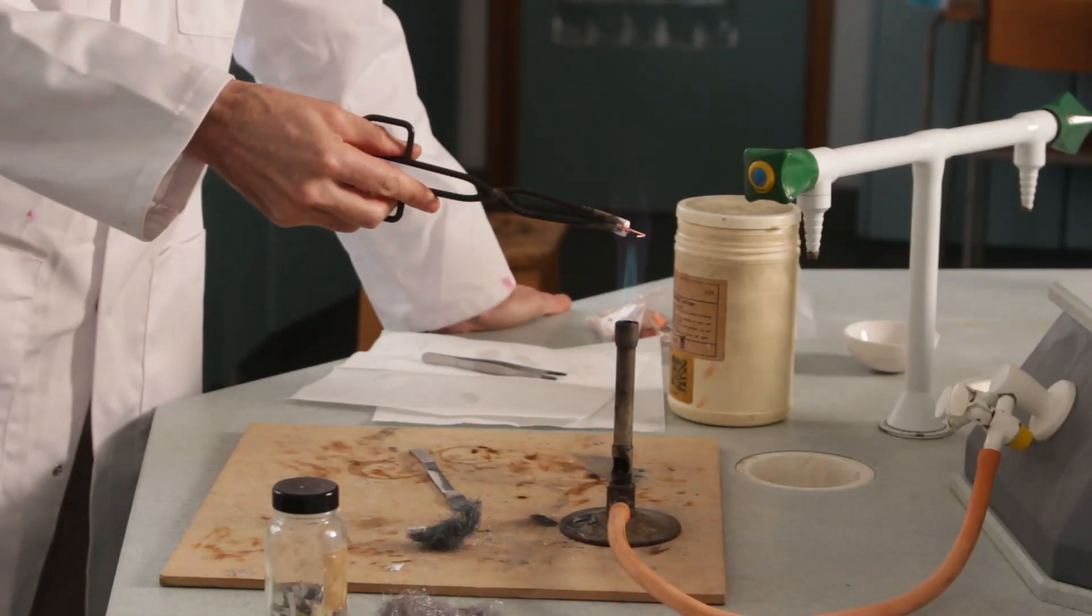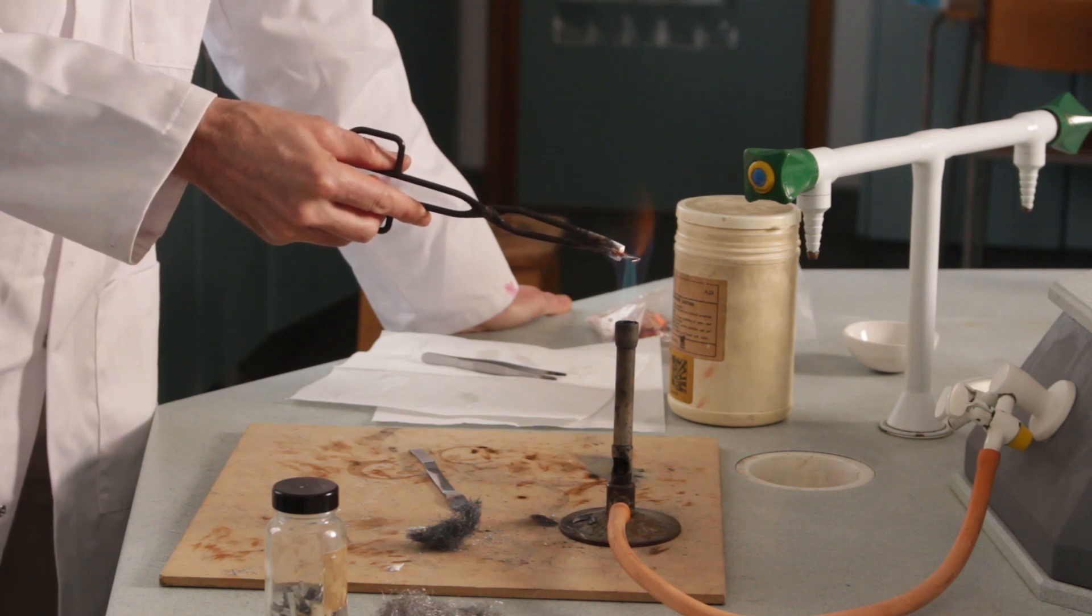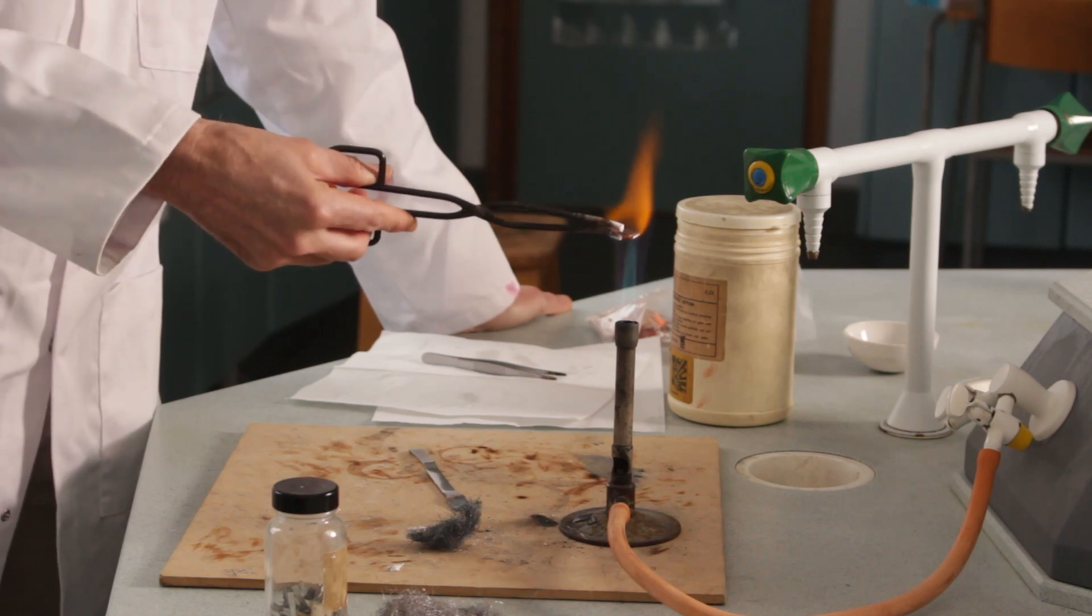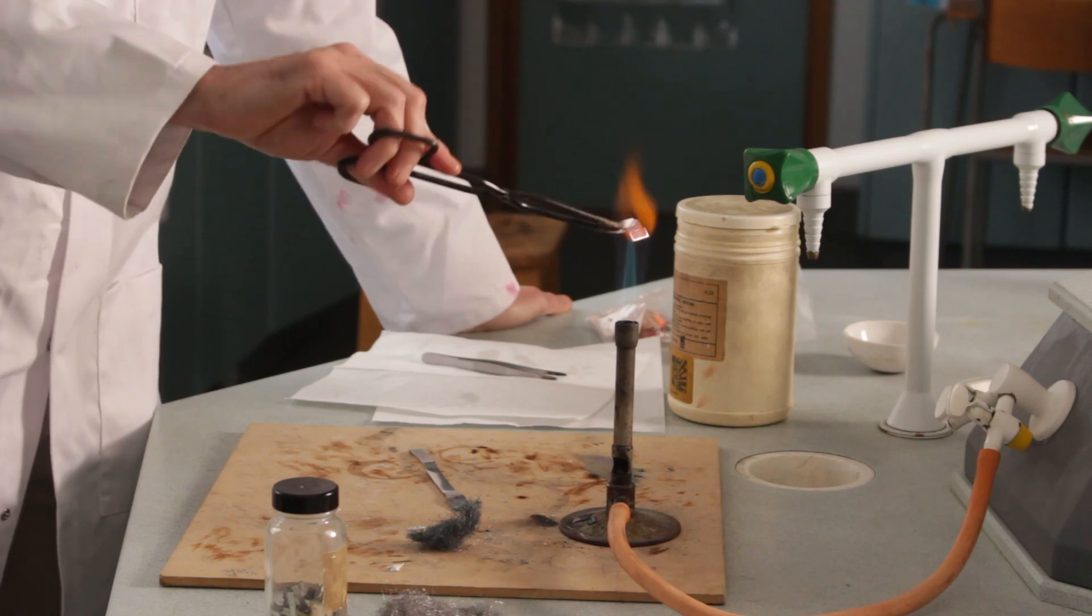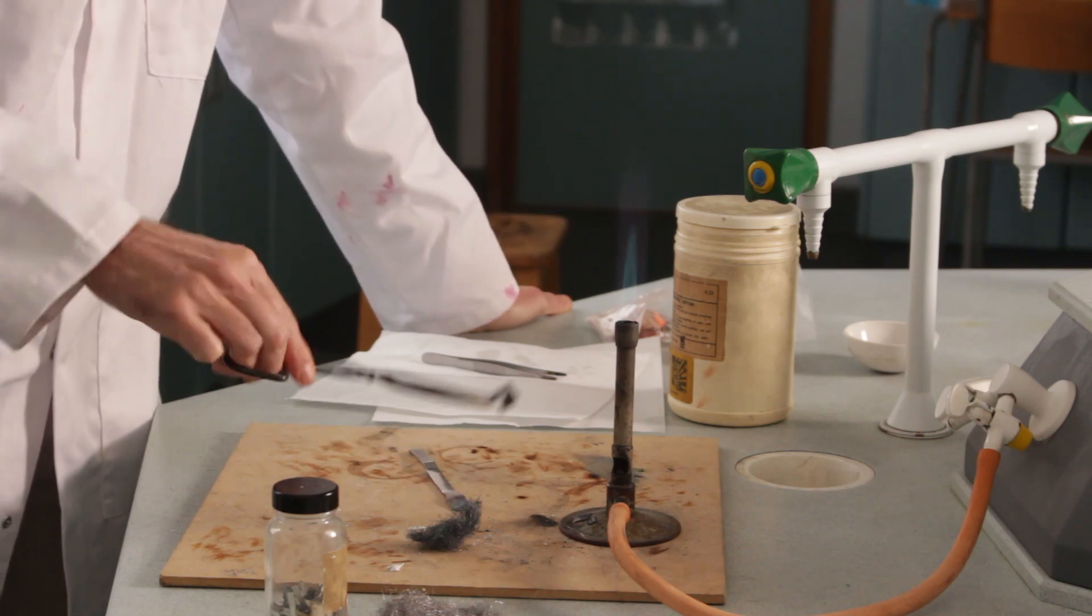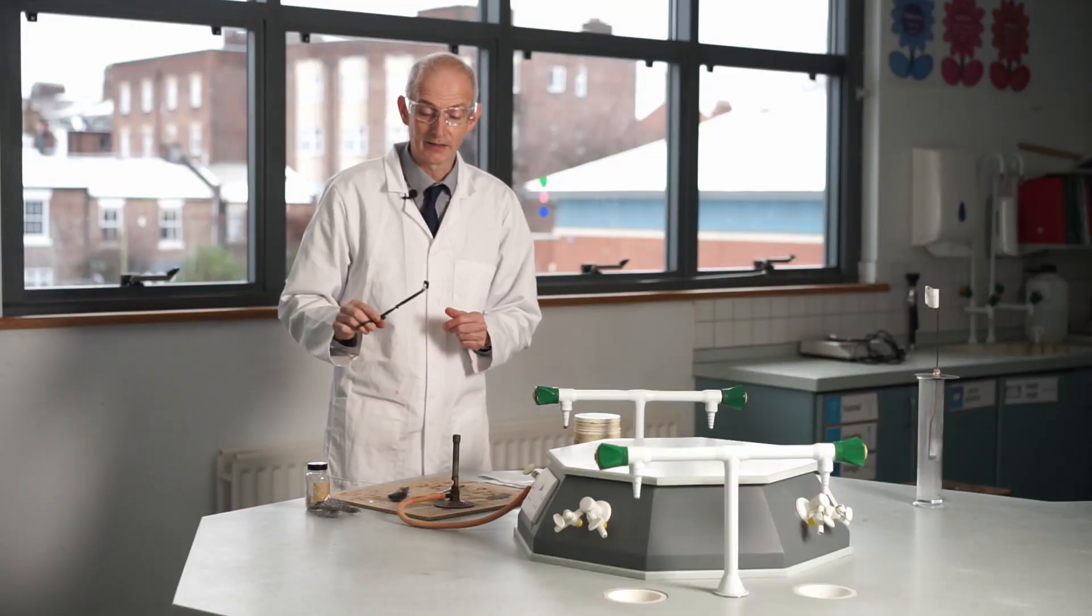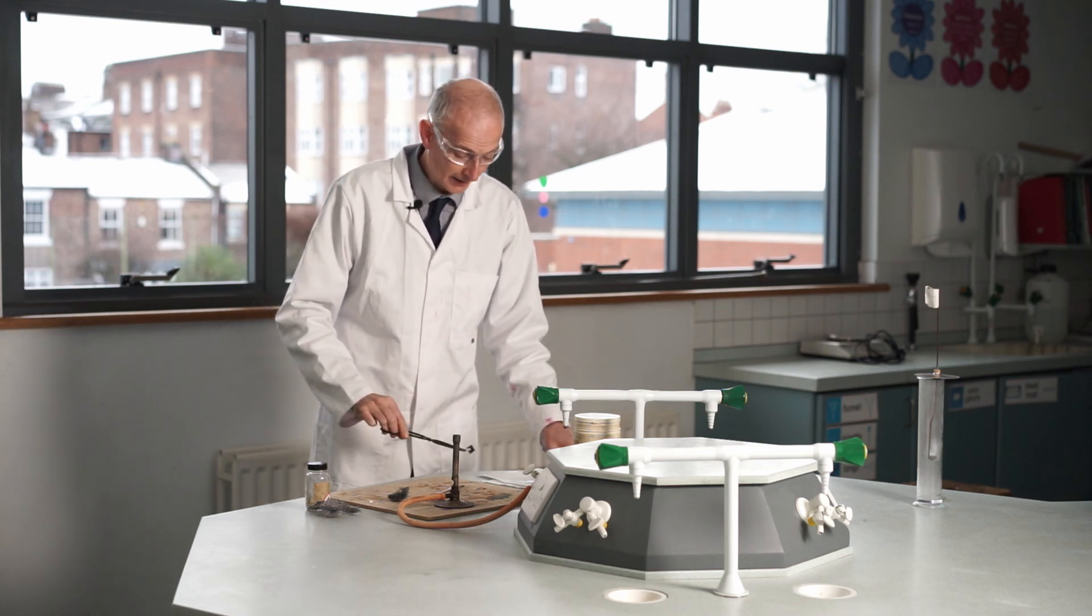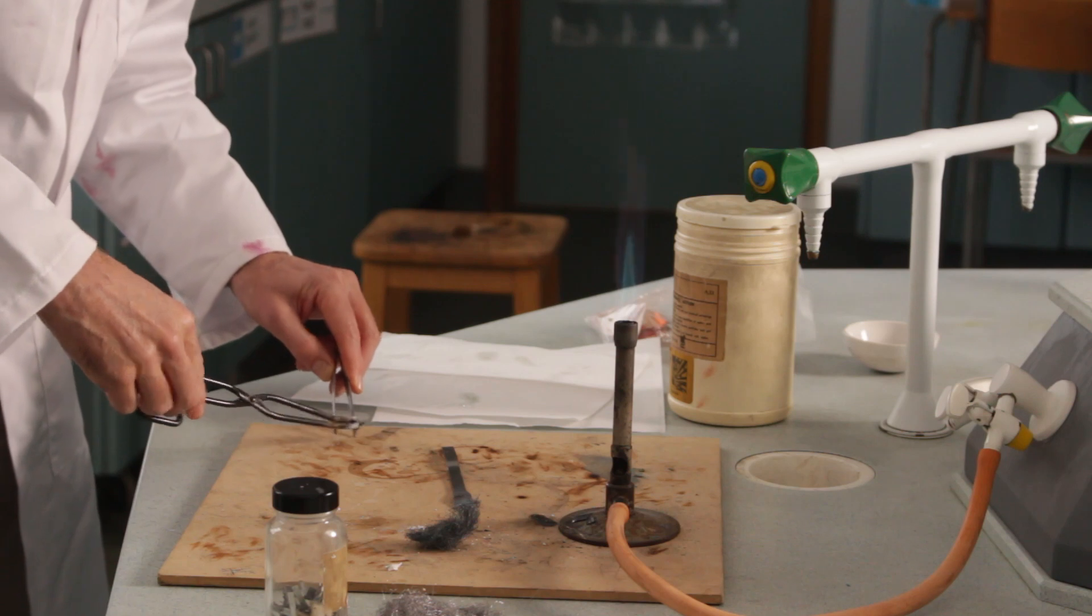I'm going to heat this really strongly, and we know what's going to happen on the outside of it. It's starting to discolor already, just starting to turn black on the outside as I heat it up. I've done what I wanted to on the outside—I've turned it black. But what about on the inside where no air could get to it? Is that going to stop the reaction? I'm going to cool it down a little bit and then open it up and see if I can look inside this little parcel.